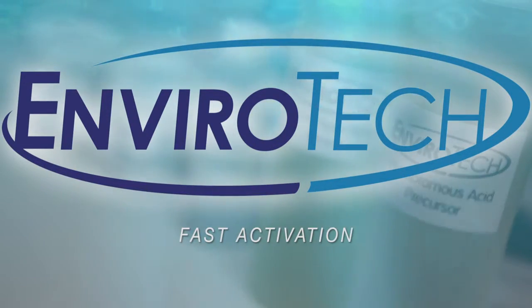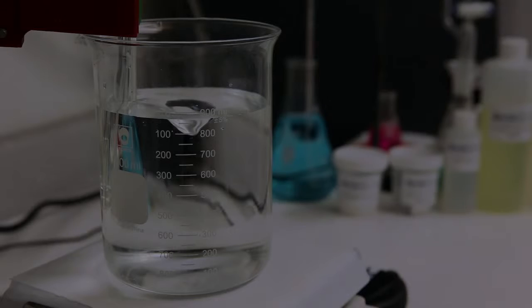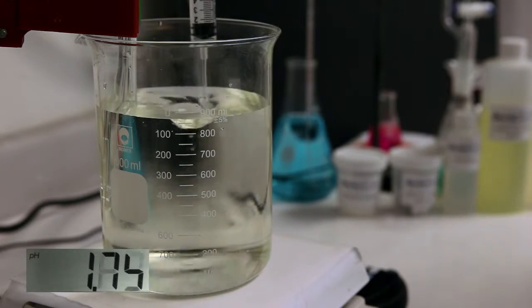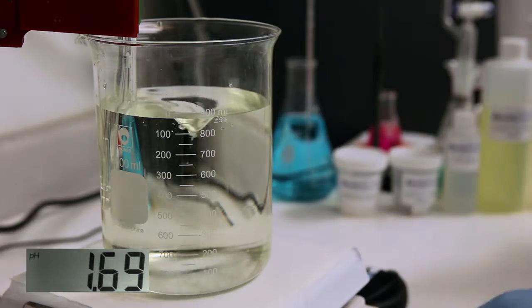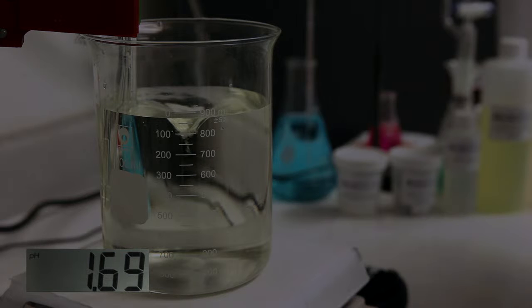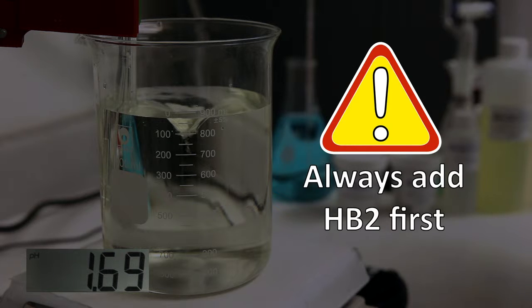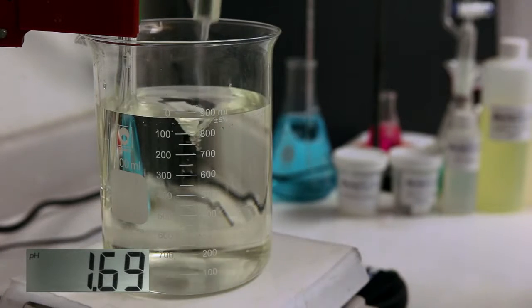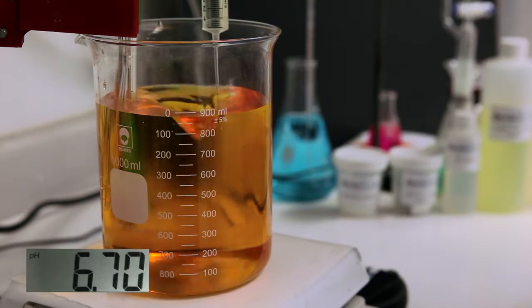Fast activation. This is going to demonstrate what happens in practice when activation takes place continuously in a pipe of flowing water. Imagine this slug of HB2 represents HB2 being continuously injected into the water flow. The low pH conditions is registered on the probe as before. Always add the HB2 first to eliminate the possibility of scale formation with high pH bleach. Immediately after the HB2 injection, the bleach is injected into the same pipe of water containing the HB2.